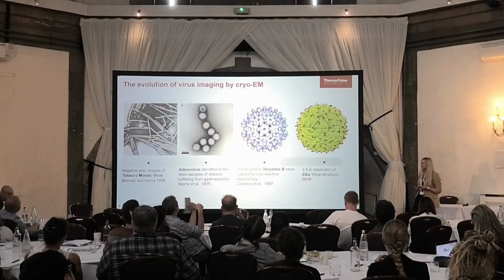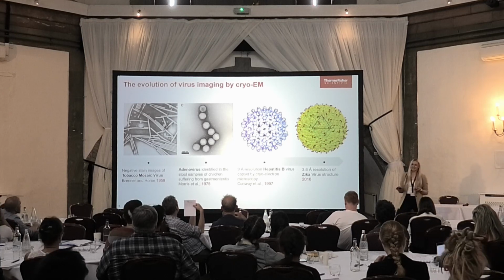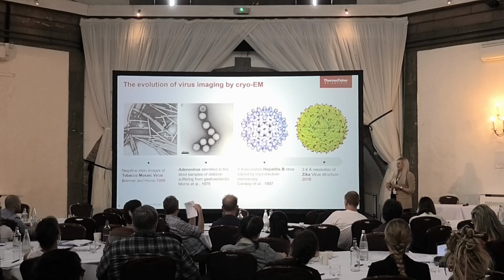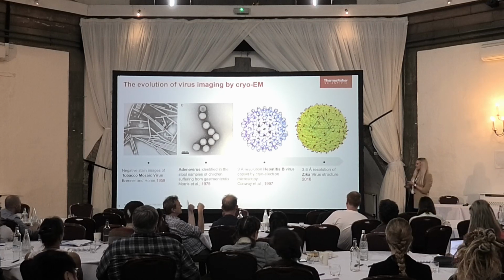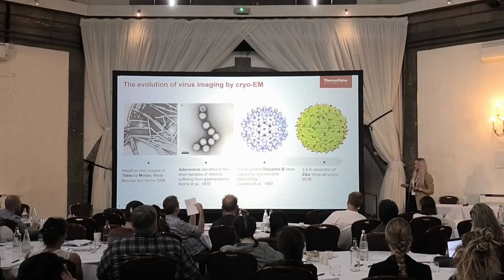depositions. And I don't need to tell all of you that it has been used for studying viruses for a really long time. If we look back all the way to the 50s, we were using negative stain to look at samples like TMV, adenovirus, and then, of course, these 2 structures here are the first structures by cryo-EM.